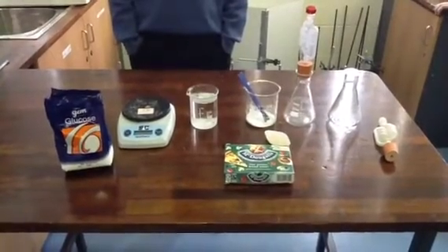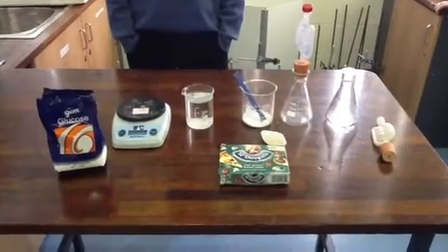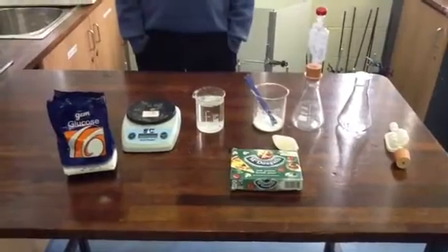Today we're looking at anaerobic fermentation by yeast. What are we going to use as a food for the yeast, Dylan? Glucose, which is a type of sugar.